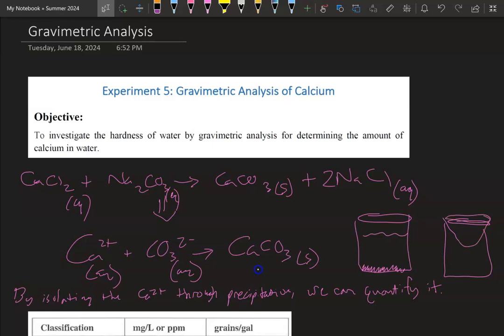These are found up on the top shelf, and in that funnel you're going to have some filter paper. The way you prepare this filter paper is you fold it in half one way, and then you fold it in half the other way, opposite. And then you grab a leading edge and you open it up. It'll look exactly like the shape of the funnel.